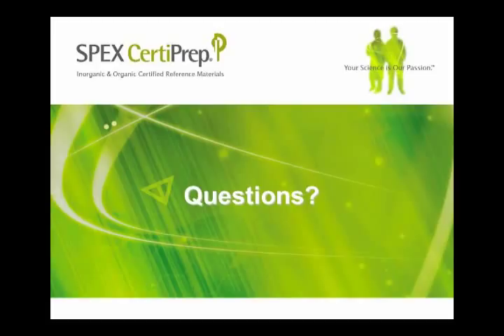We are planning a few more additional pieces of information. Here what we did, we focused our attention only on the analysis by ICP. And by no means is a CRM restricted only to the analysis. You have uncertainty due to sample preparation. You have uncertainty due to the homogeneity, stability, as well as any methods that you use to compute your certified value. I have not gone into details of all the other things because I'm planning to save that for the additional seminars that we are planning here.